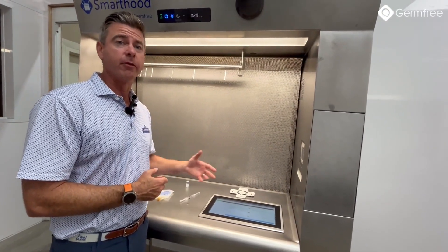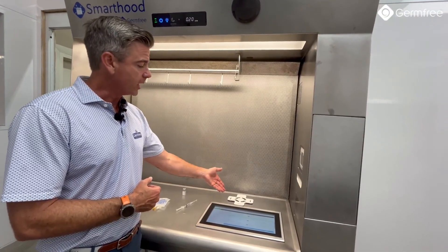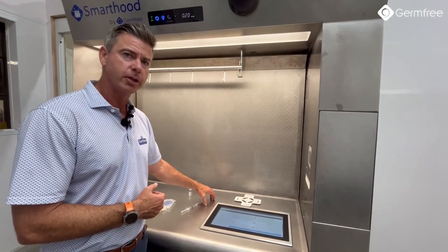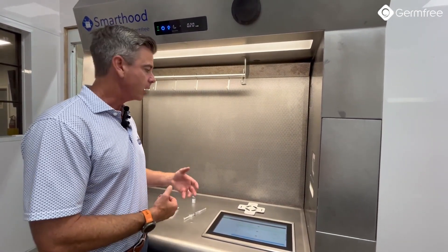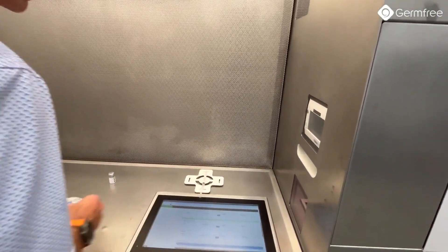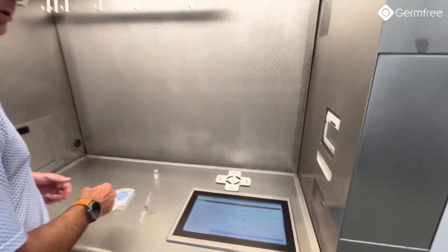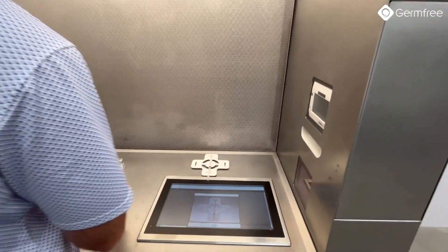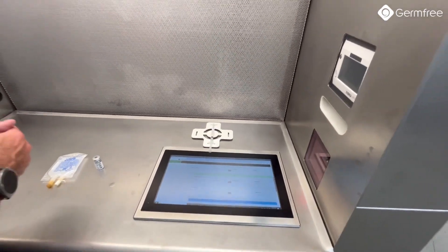Here you can see SmartHood in a gravimetric configuration. Instead of the backlit photo plate, you would have a scale. The scale is built in underneath the work deck, so it's not going to catch vibration, and it has a dampening system. This allows for the most accurate gravimetric weighting of all drugs. If I'm going to do a gravimetric weight, I can put it on the scale and that launches the gravimetric capability built into SmartHood. You can still capture photos just the way you would without the gravimetric setup — I can capture photos and weight at the same time.